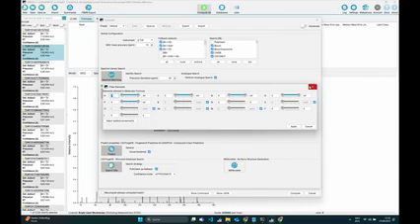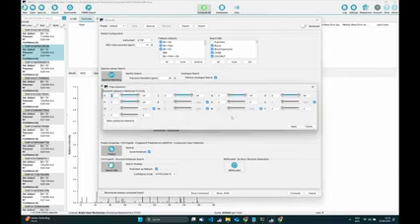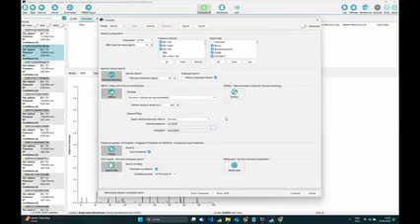You will want to, I will just close it again to show this, click on these three dots here, and then you get this dialog. Here, with F for fluorine, you can now select how many atoms will be allowed. You don't want to go crazy with this setting, because if you set too high a value, this also might result in large runtimes. Just set some reasonable value that you might expect in your data. Okay, but let's just leave it as default here.